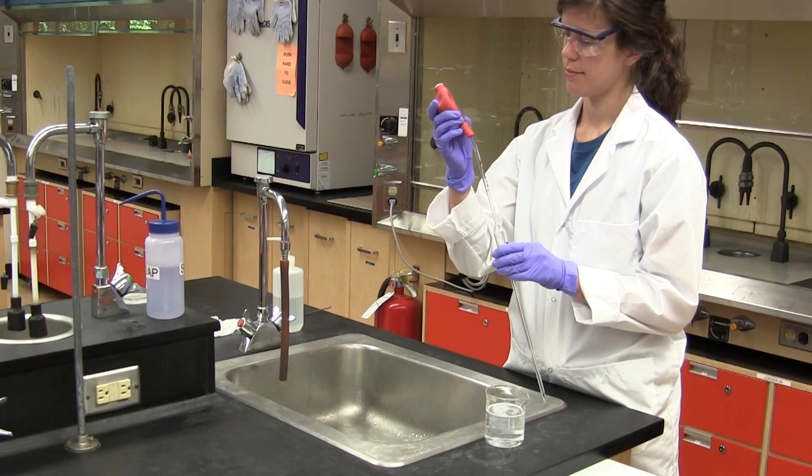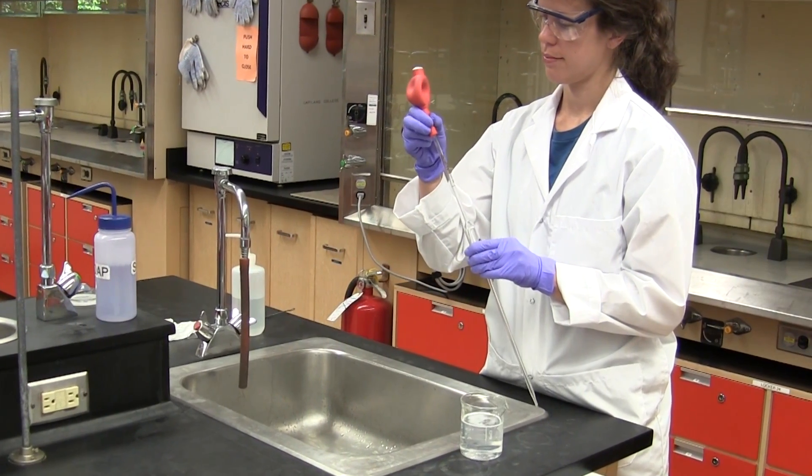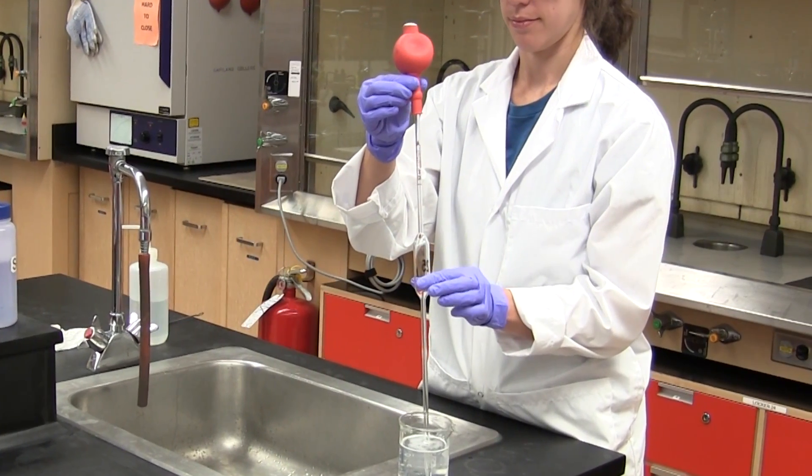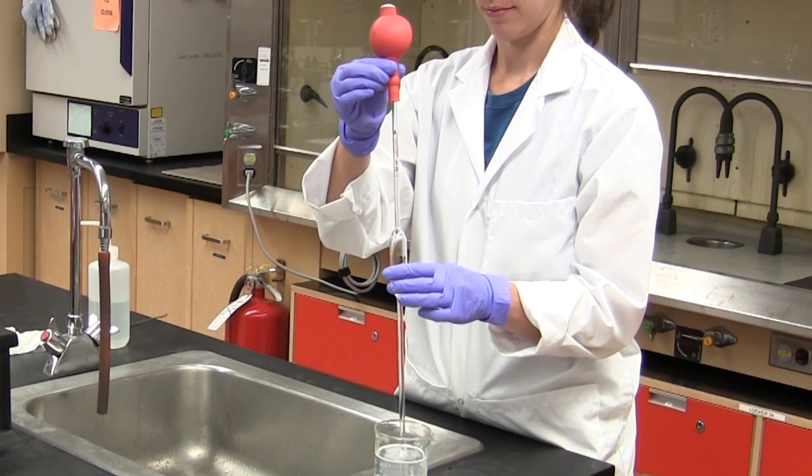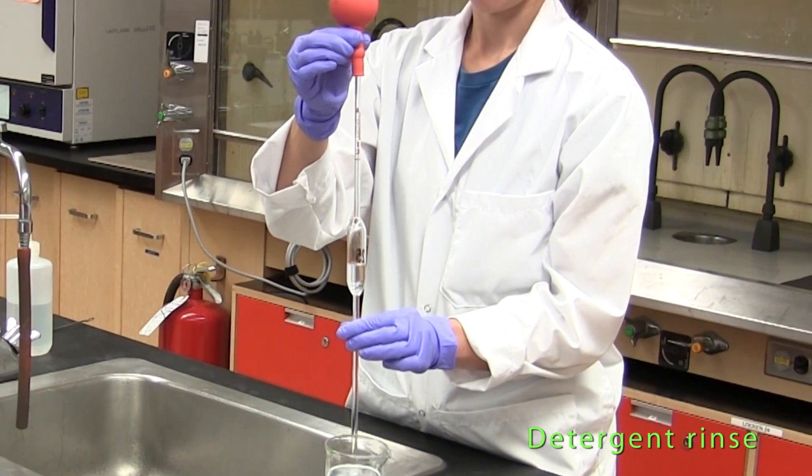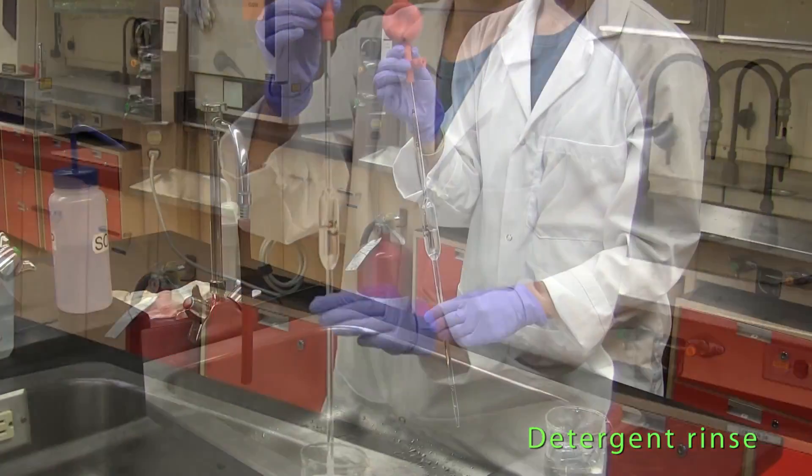Before the pipette is used to make a precise transfer of liquid it must first be cleaned. The tip of the pipette is immersed in some hot detergent solution and the liquid is pulled up into the pipette by using a pipette filler until the bulb of the pipette is about half full.